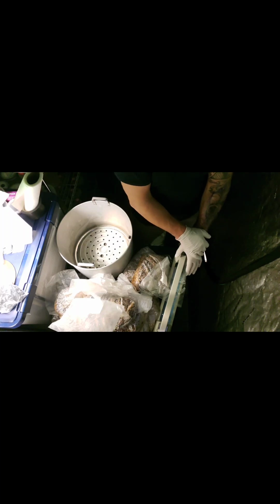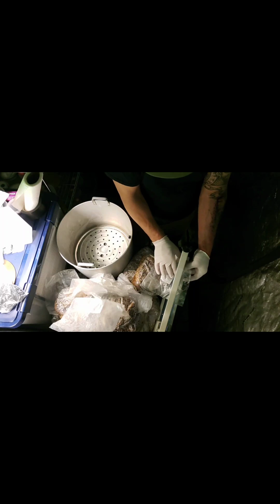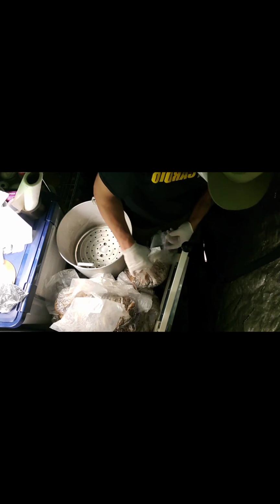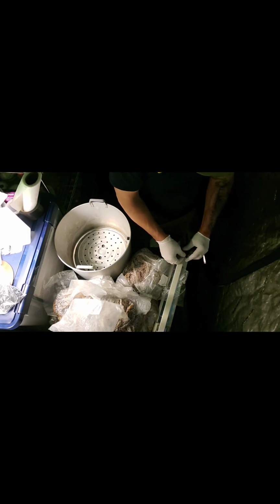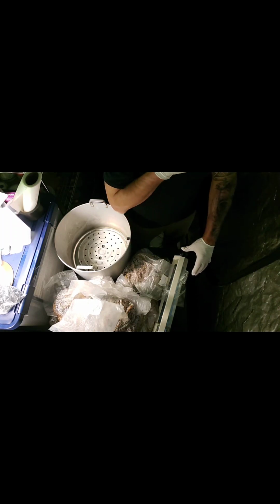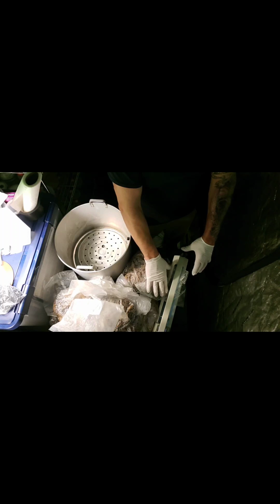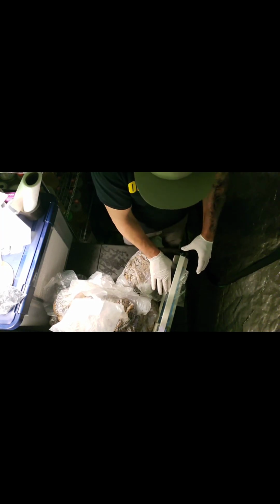I'm gonna go through and double seal them all. Just under where they were sealed. And this has a spring on it, so when you start feeling that spring tension, you're pushing too hard. And still warm. Nice.